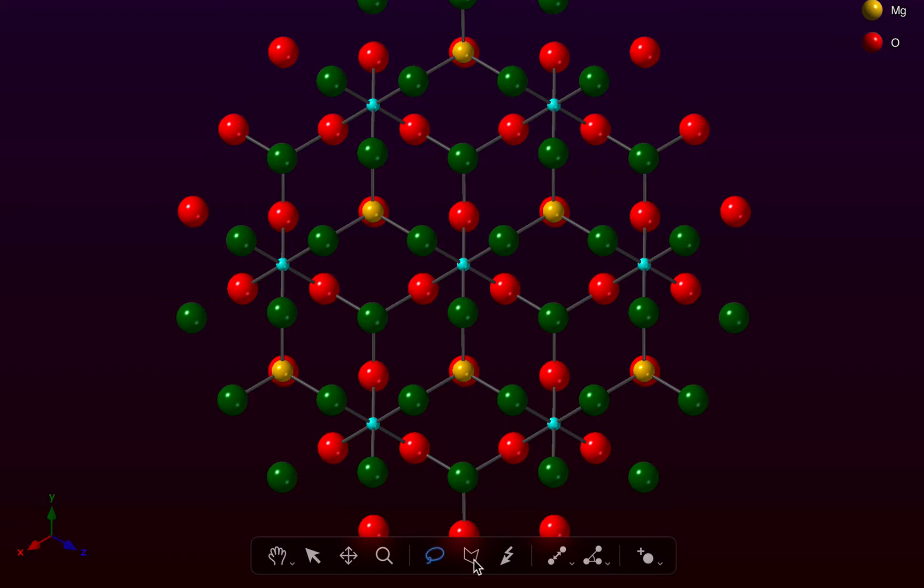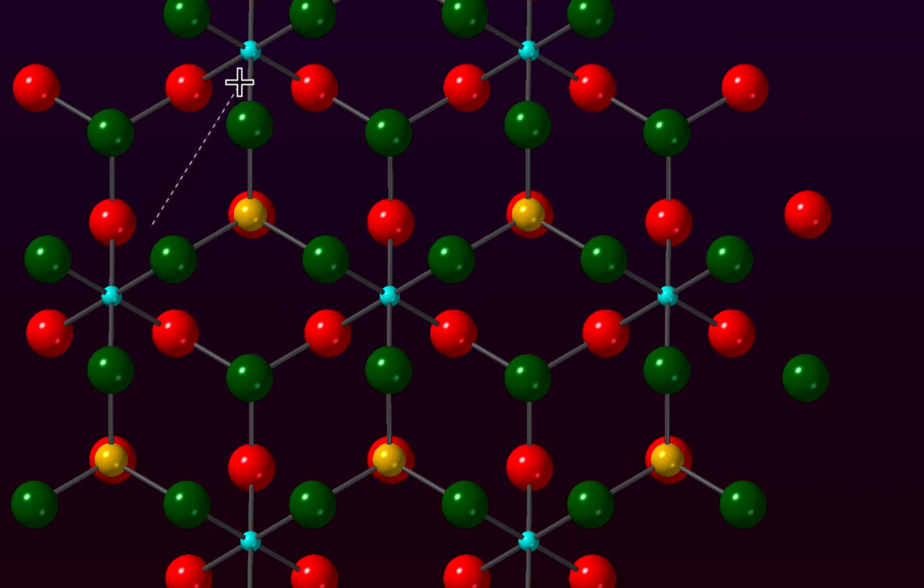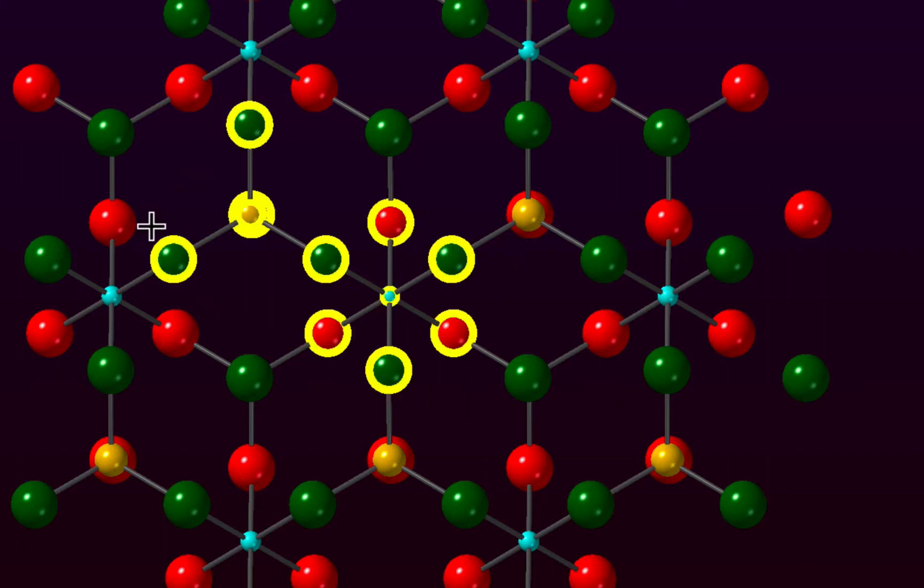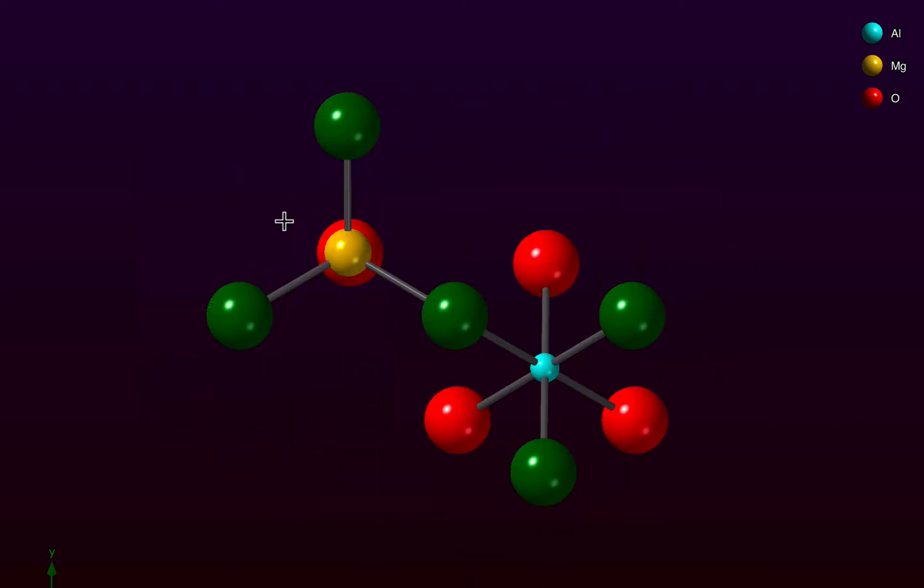CrystalMaker also provides a polygon tool and that allows you to define a polygonal selection which in some cases is easier to use. To close the polygon just move the mouse back over the starting point and the little square appears. And again we can isolate the selection by right clicking and choosing the isolate selection command.